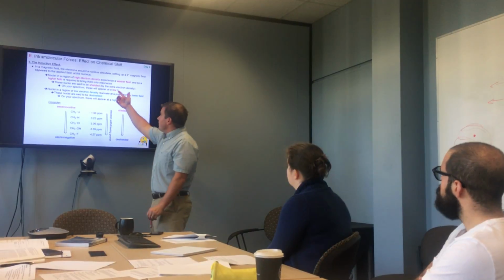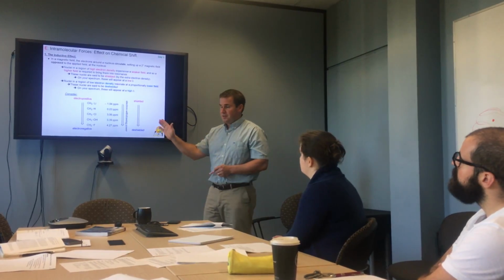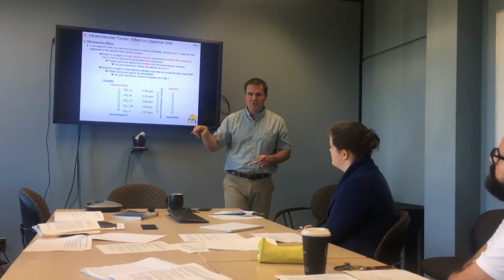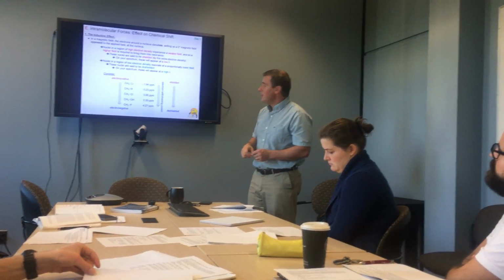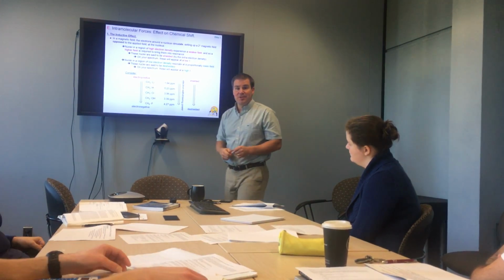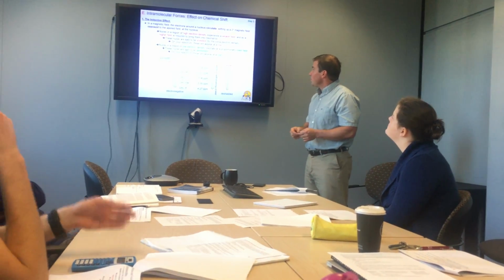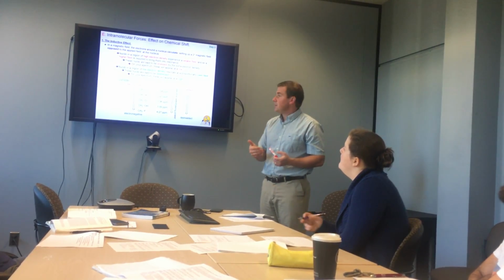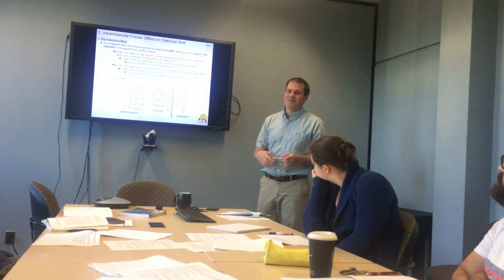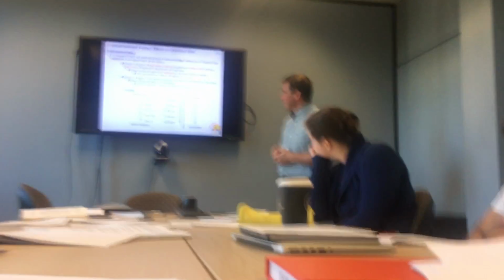So we say that these nuclei are shielded, and on your spectrum, these are going to appear at a low chemical shift number, which we give the symbol delta, Greek letter small d. By comparison, conversely, nuclei that don't have very much electron density around them, have less electron density than your average nucleus, will resonate at a proportionately lower field, and we say that these nuclei are deshielded. In your spectrum, these are going to appear at a high chemical shift number. It's very backwards, I know, but that's what we get when we have history. We're stuck with it.